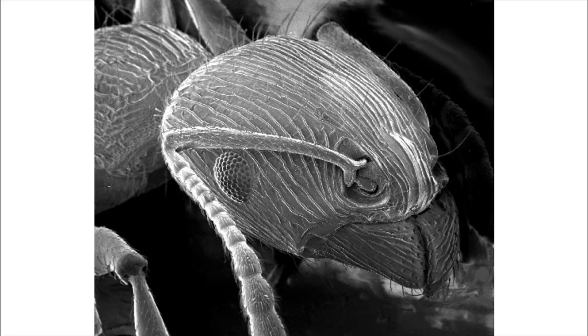So a scanning electron microscope essentially basically fires a beam of electrons. And then they're reflected off the surface. So this is used to look at things that are too thick, where the electrons wouldn't be able to pass all the way through. So you can see this lovely image of an ant's head. Electrons have been fired at it. They bounce or reflect off the surfaces there. And that can be analyzed to produce an image. So we essentially see how the electrons have bounced off, how they've been reflected in order to produce this image.